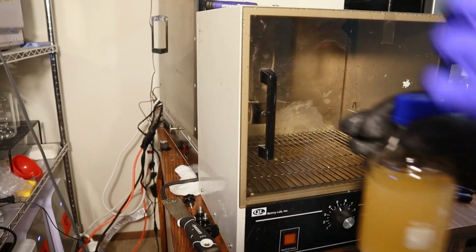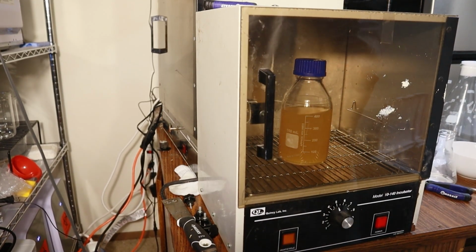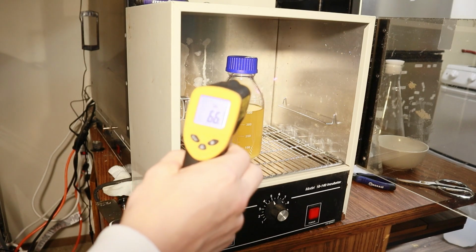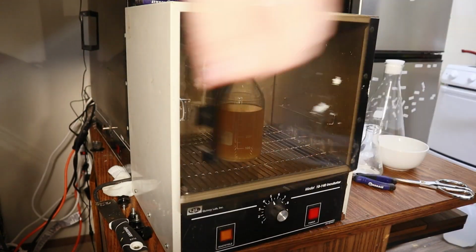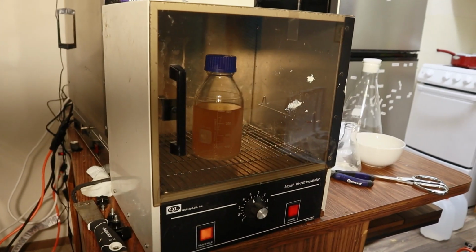I forgot to include this in the script, but when you remove your bottle from the autoclave, it is really hot and agar solidifies at around 40 C. If you were to pour plates right away, you'd have to wear gloves and it would cause steam to condensate on the lid, which would ruin your plates. So I put them in this chamber which is heated to 50 C, which is the perfect temperature to pour agar plates at if you're not inoculating them before pouring.